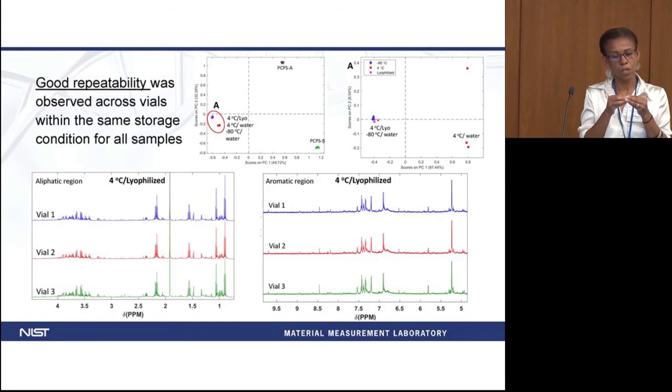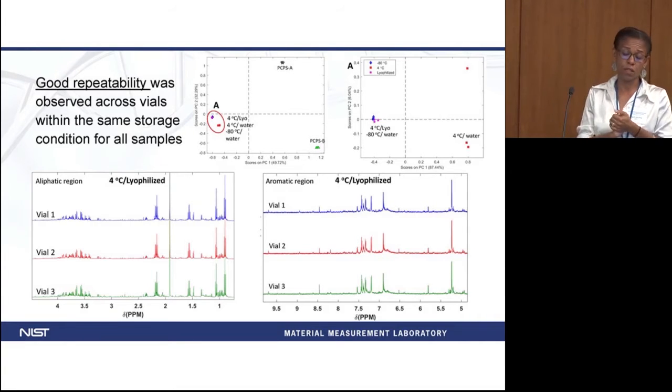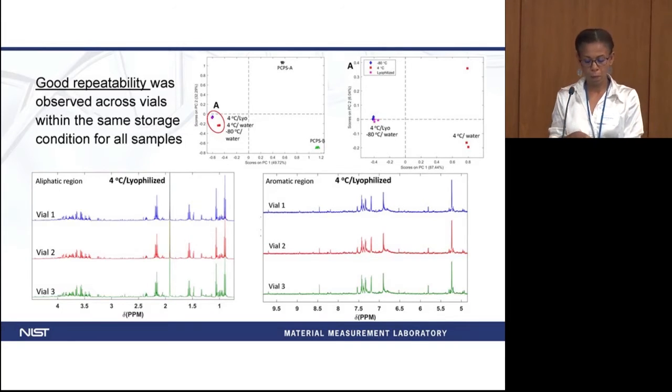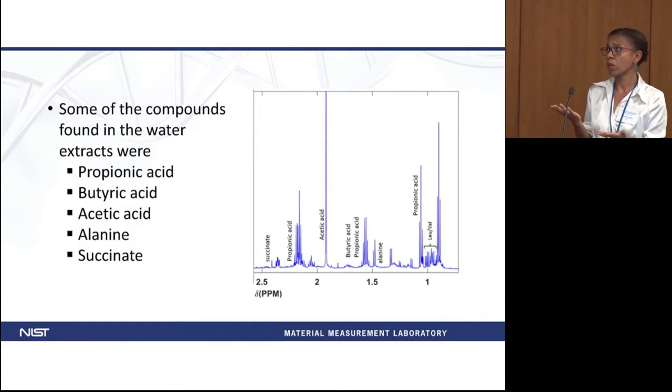If you expand region A, you can see that the 4 degrees, the lyophilized and the -80, they're still very close, and the water one, it's a bit different. And I have one of the data that it was a little bit apart, so I'm trying to look into this as well. So some of the components, they are the usual suspect when you have extraction in water.